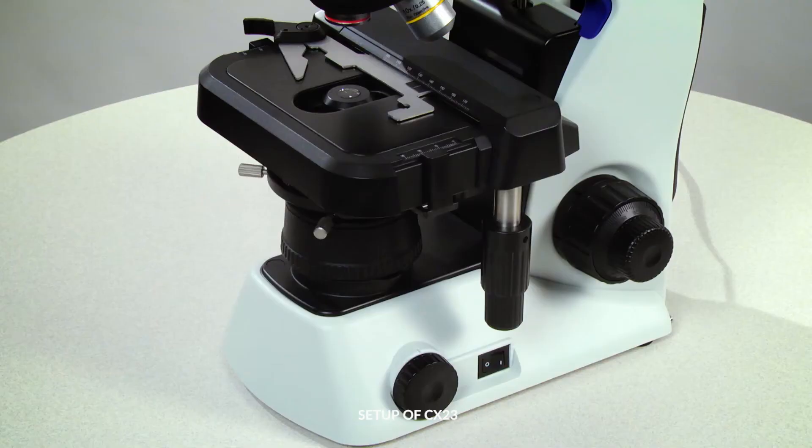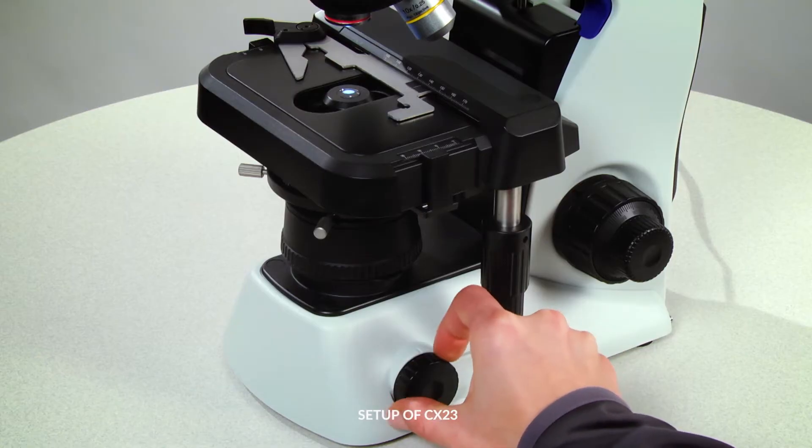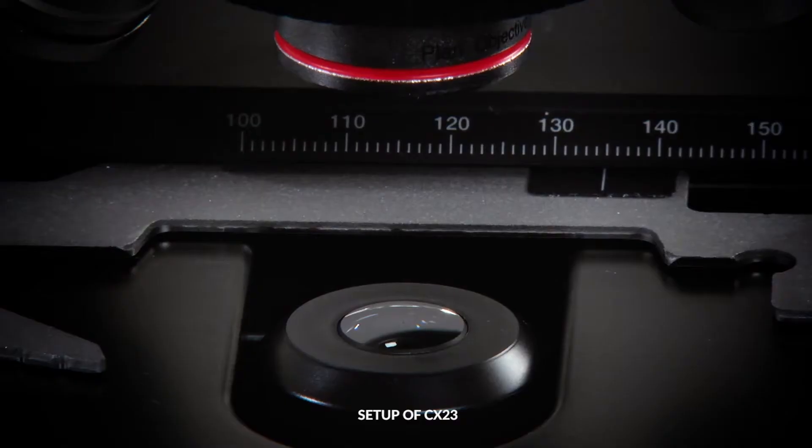Turn on the LED illumination using the main power switch and adjust the LED brightness using the light adjustment knob. You should see the LED light turn on through the objectives or at the bottom of the microscope.